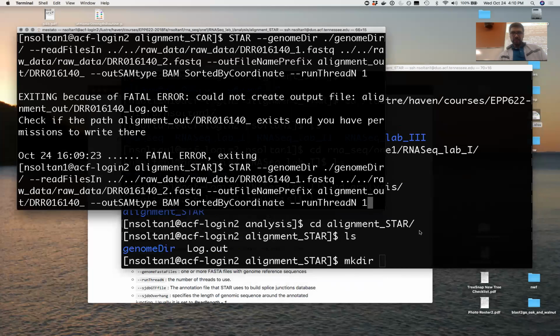So it gives you three things: starting, loading, and then the genome indices, and it takes maximum 20 to 25 minutes, let's say 20 minutes. But at the same time, you can copy the results that I just created a few days ago. Well, it's 4:11. We can do it next time. You'll have the entire class next Wednesday.